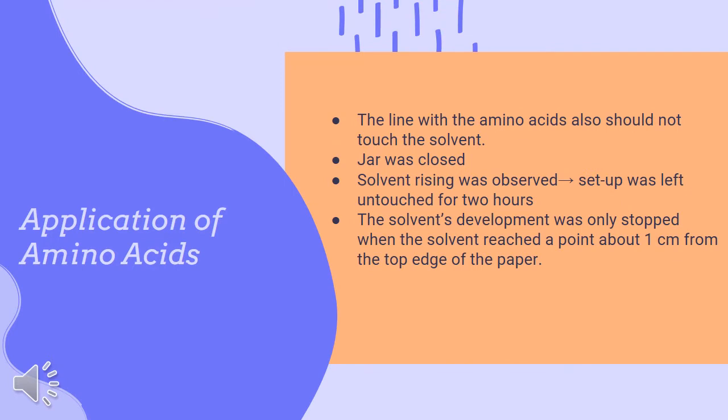The jar was then closed and the rising of the solvent was observed by leaving the setup untouched for 2 hours.